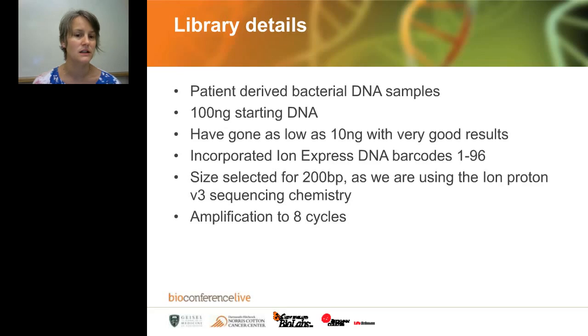Again, it was a large project with about 170 samples. We have some patient-derived bacterial DNA. We started the preps with 100 nanograms, but we have gone as low as 10 nanograms and seen very good results with this as well.